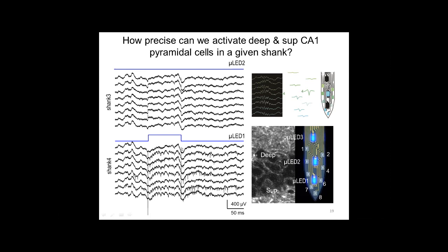We like artifacts, I have to say. I mean, it's good not to have them, but for us, for instance, they are very useful to facilitate identifying where the stimulation was applied.